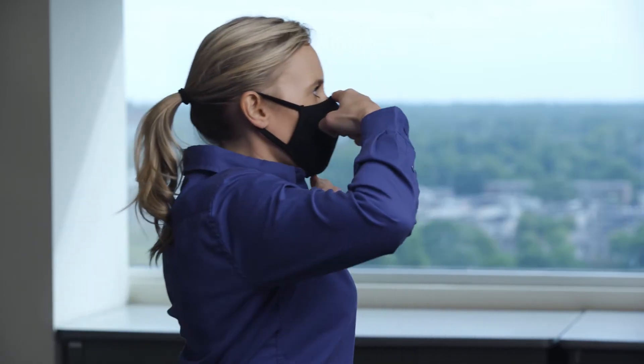Immediately after washing your hands, place your face mask or respirator over your nose and mouth and ensure that it fits snugly. Secure the straps around your ears or behind your head.